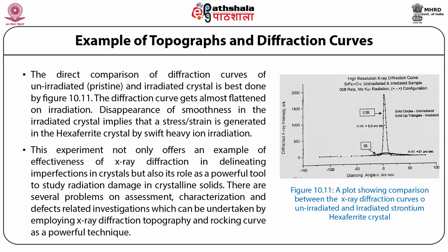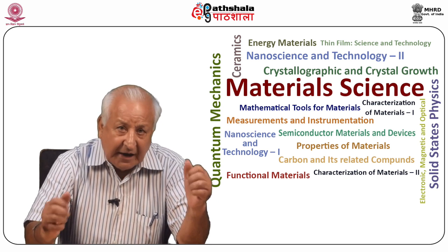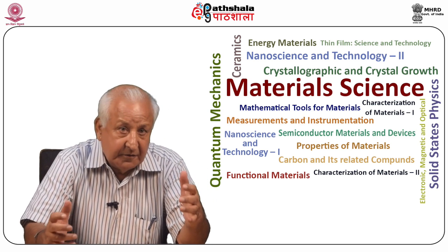There are several problems on assessment, characterization, and defects-related investigations which can be undertaken by employing X-ray diffraction topography and rocking curve as a powerful technique. So, students, let us now summarize what we have learned in this module.